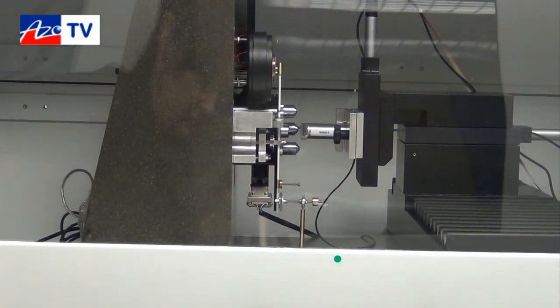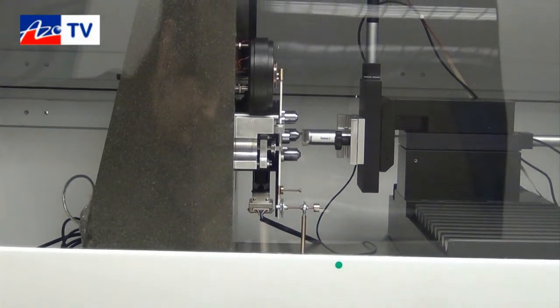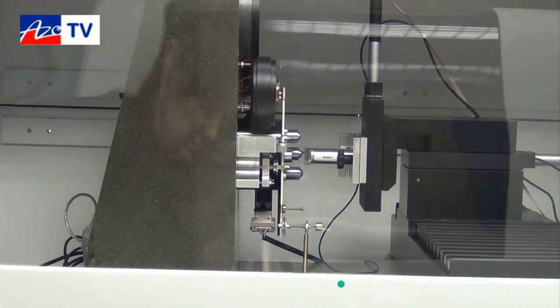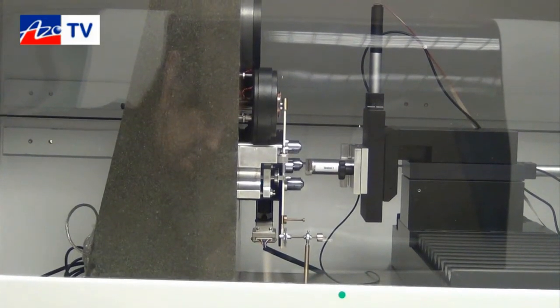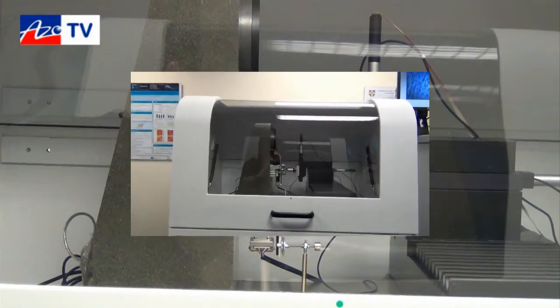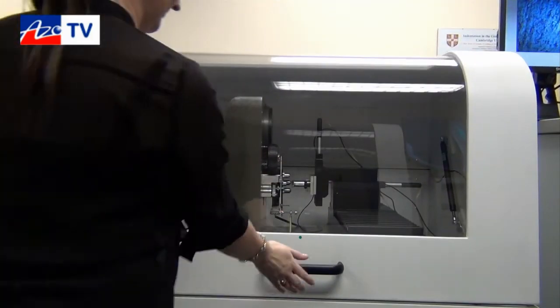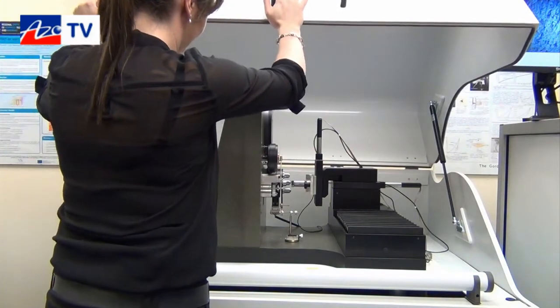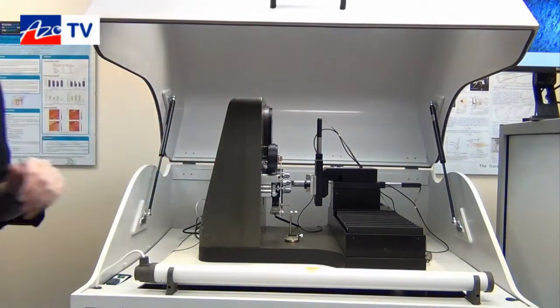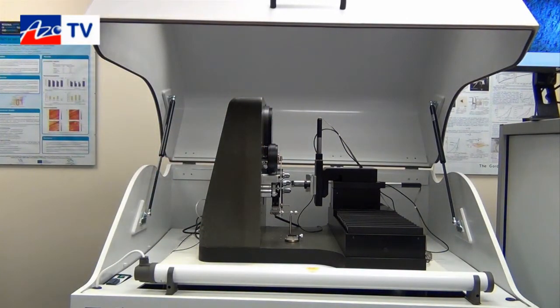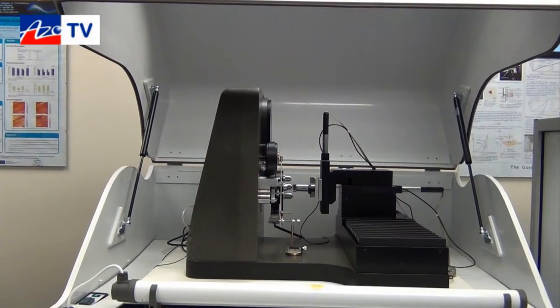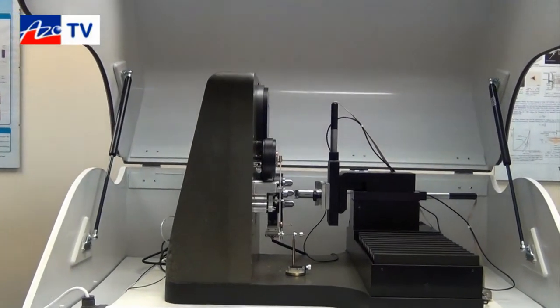What sort of stuff does the NanoTest Vantage actually measure? What sort of properties can people measure? As a central instrument, it does nano indentation over a range of temperatures and strain rates. It can do nano impact, which is completely unique to this instrument, offering very high strain rate and dynamic hardness measurements. You can also do repetitive impact to look at fracture and fatigue, and we also do nano scratch and wear and nano fretting, both of which are tribological studies.